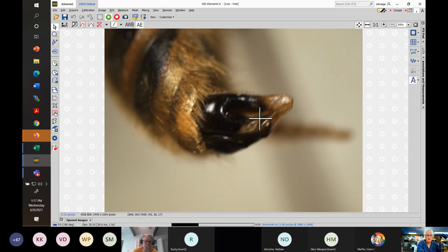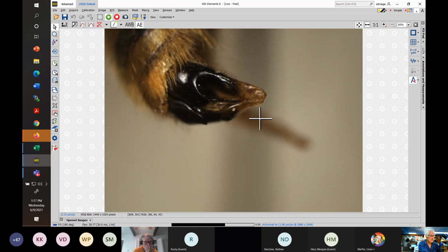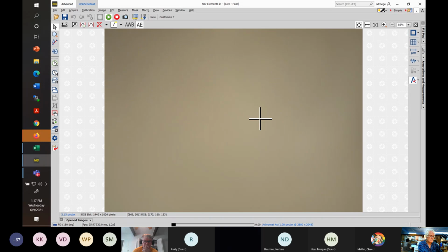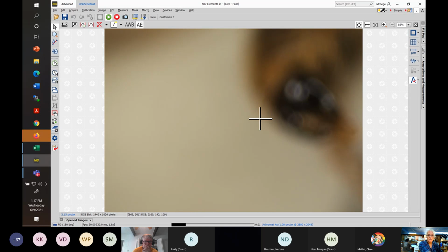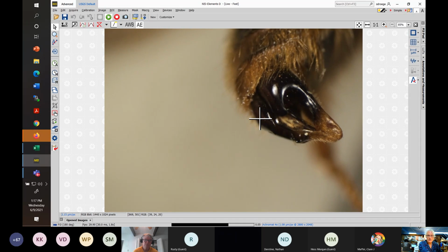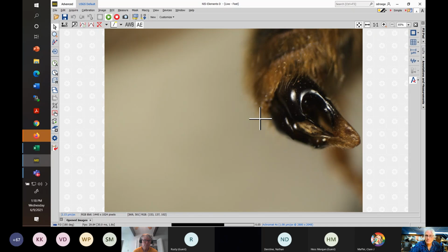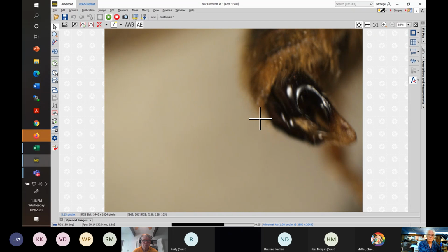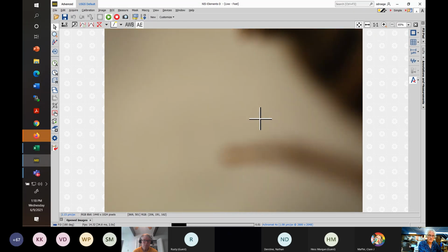Because we're doing a lot of volume work, we tend not to do that and try to come up with identifications that don't include genitalia characteristics. But it is a really good character if you have the time to spend everting genitalia that are not already everted. Mostly they're not everted though. So that's the genitalia itself. That's not part of the sternites.